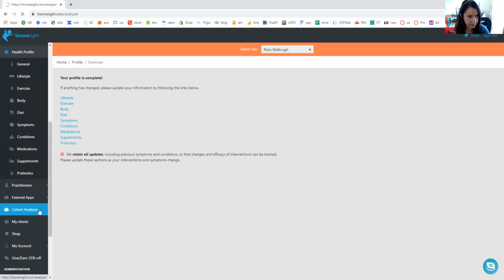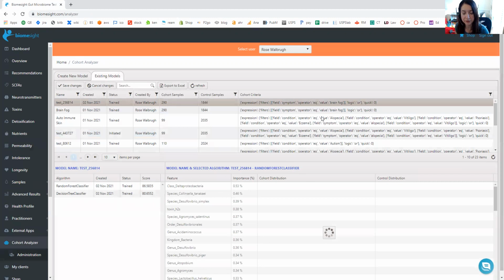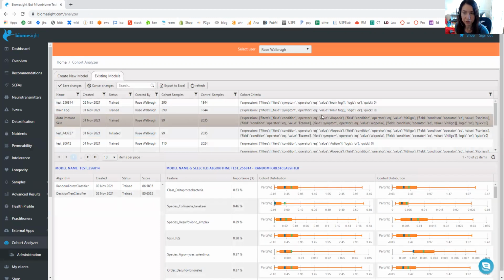So I hope that was clear. Just a reminder that this feature isn't available to everyone. If you would like access, please get in touch. We would be really happy to give you feedback, but we can't give proper support at this point because it is pretty much in the alpha stage. We are learning and updating it very, very quickly at this point in time.